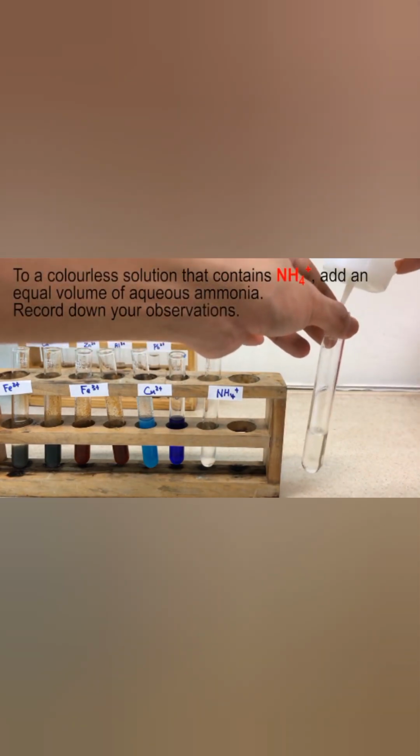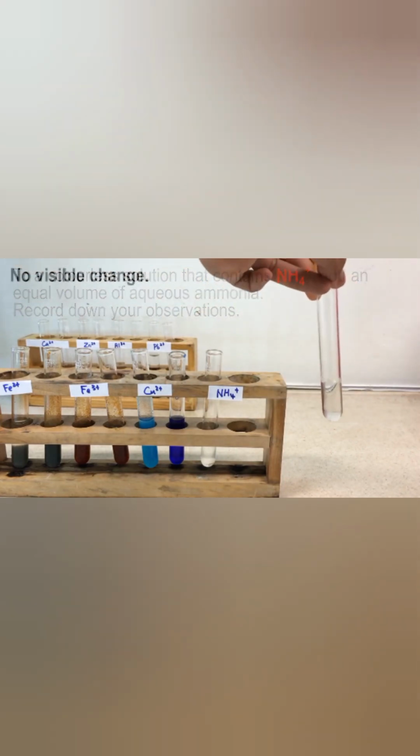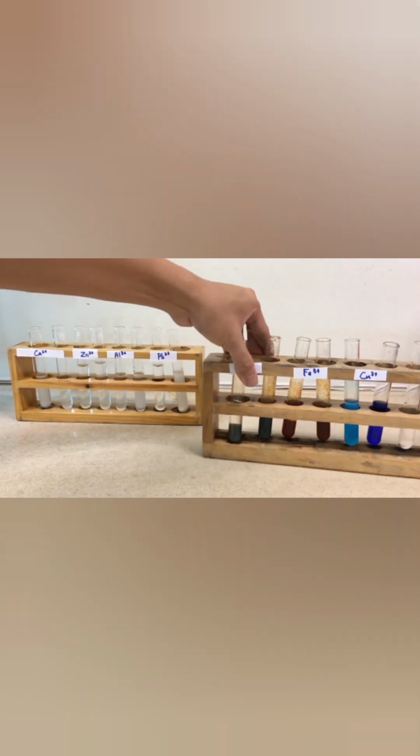Okay, to a colorless solution that contains ammonium, add an equal volume of aqueous ammonia. No visible reaction is formed when you add that. No visible reaction is seen when adding a little drop of that.